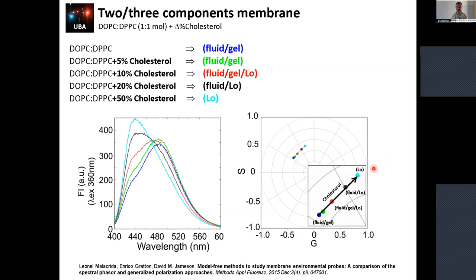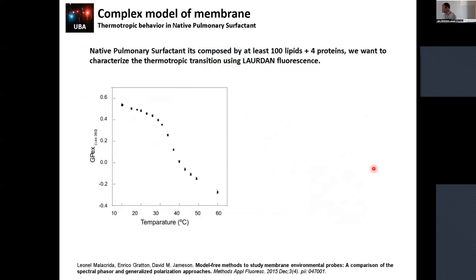So phasors immediately show you what is going on in the situation. You have many different components, but all lie between the origin and the end of the trajectory. But what happens if you have a more complicated system?